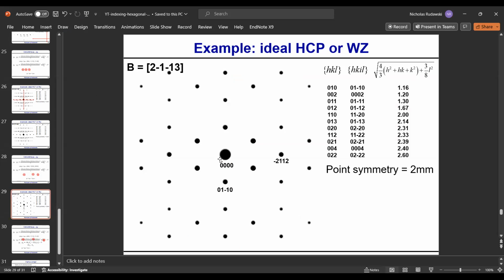And then let's do the sanity check. Do we get a 0 dot product with these? Let's see. This one, obviously, we do. This one, let me see here. We get 4. We get minus 1. Let me do this here. So we get minus 4, minus 5, minus 6 plus 6. Yep, so the math works. So there's our zone axis.